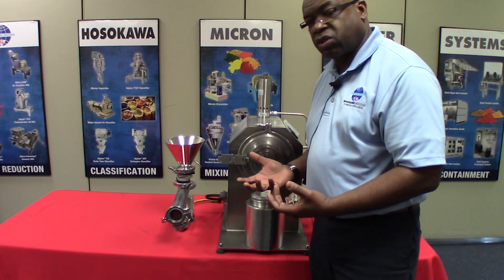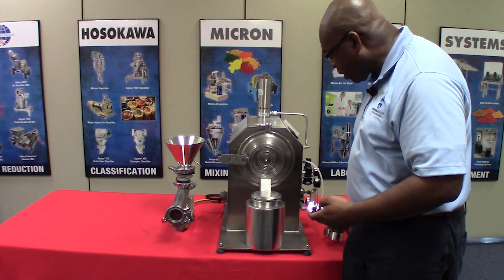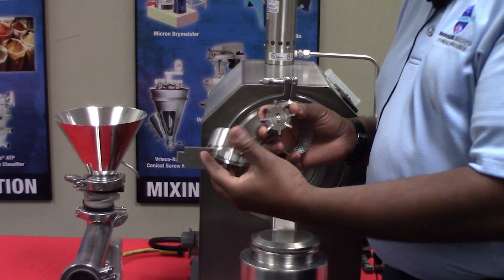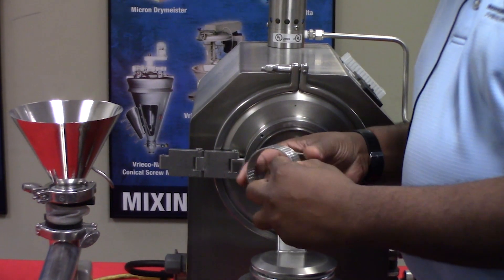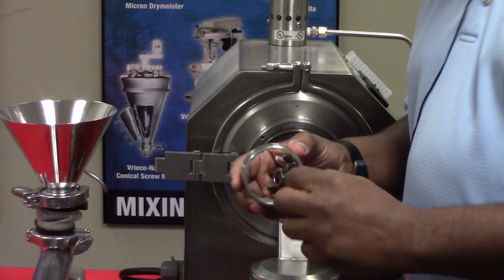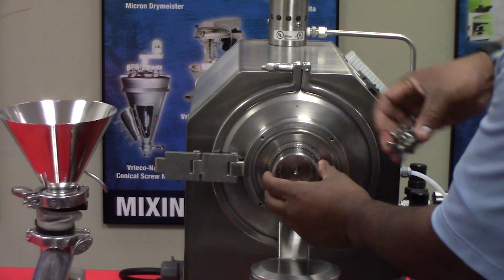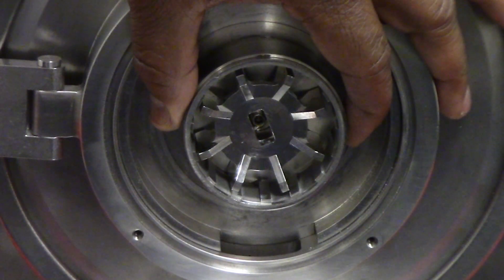You may have materials that are fibrous. Fibrous materials do not work very well with pin discs. In that case, we'll use our rigid rotor. This rigid rotor can be used with a full track as you see here. It could also be used with a full screen. Or we have another option — which I don't have available right now — a half track, half screen: half of the track and half of the screen as one device.